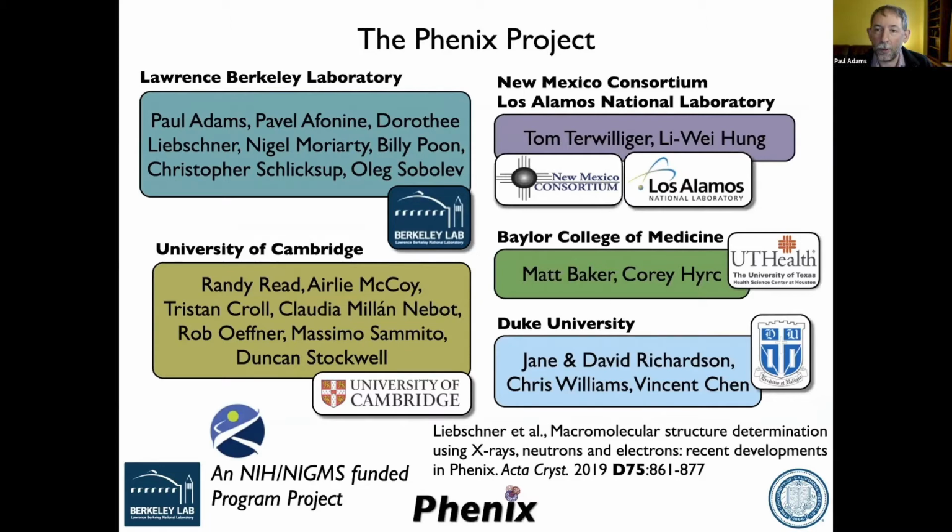So I'm comparing the map to map FSC and the model to map FSC. From the published studies I've seen, and even from my own data, model to map FSC is generally higher than the map to map FSC. Is it supposed to be that way?